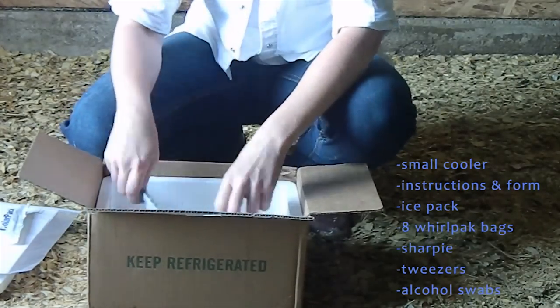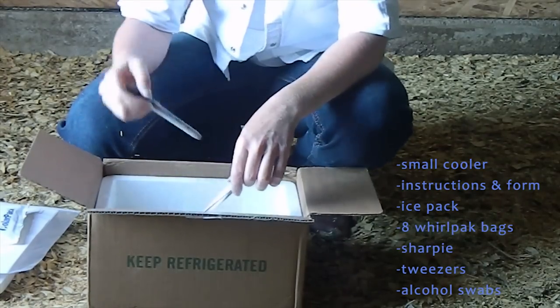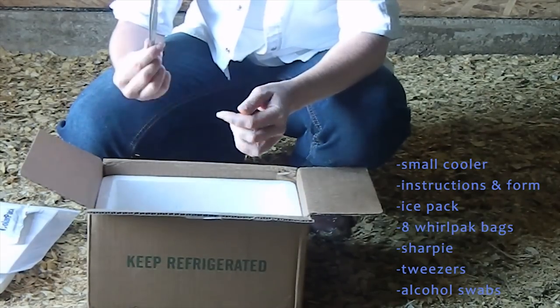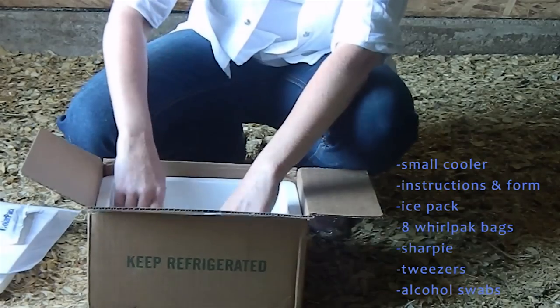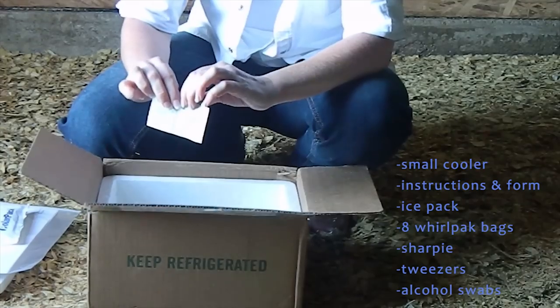It is also going to contain a zip lock. It has a sharpie in it to mark your samples. It has a set of long tweezers so that we'll be able to do our swab sampling inside the water line, and it has several alcohol swabs. These are what you're going to use to sterilize the tweezers.